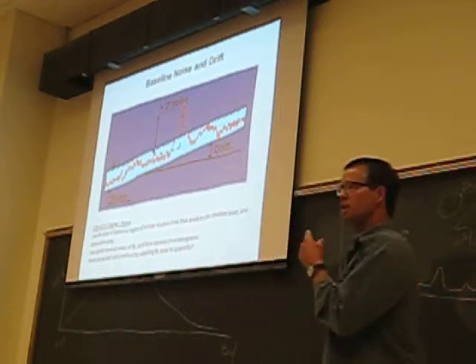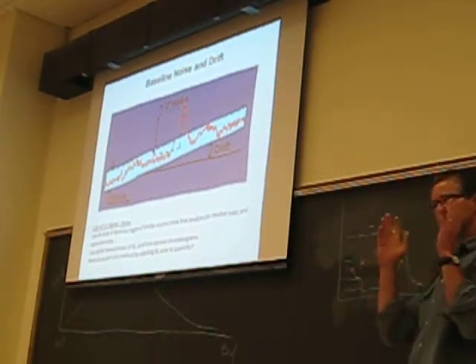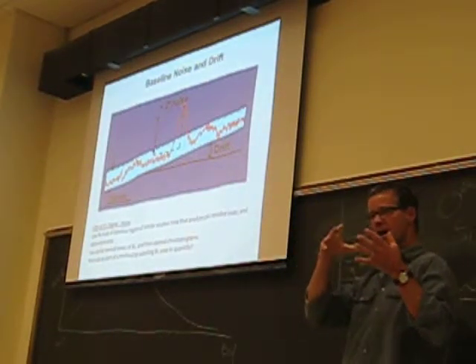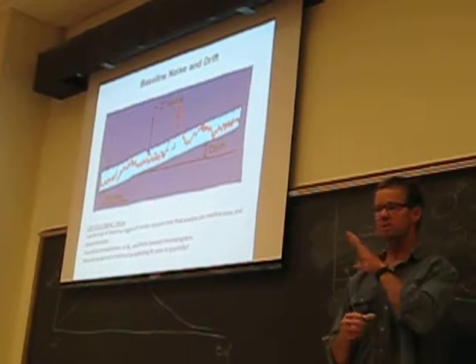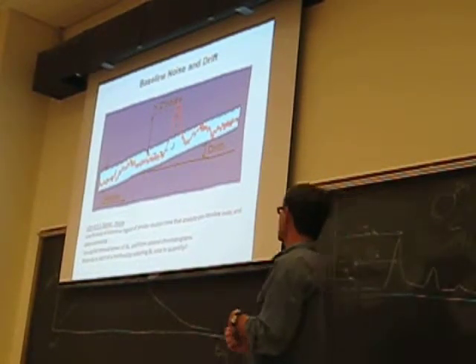So I want to step back a second and say now, with all detectors, the detectors have some electrical potential applied, and then when something hits the detector, whether it's a photon, typically, or if it's an ionized atom, it's a different detector.